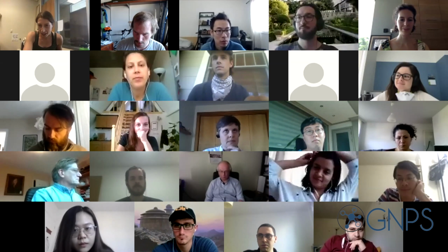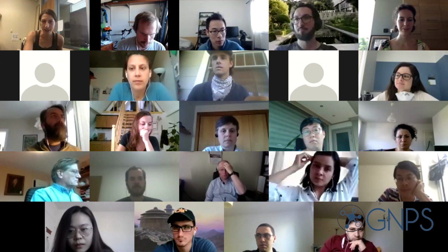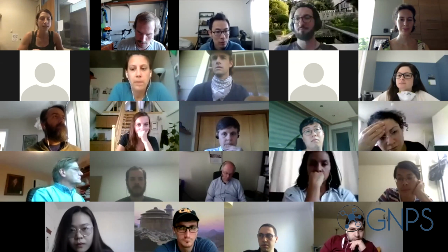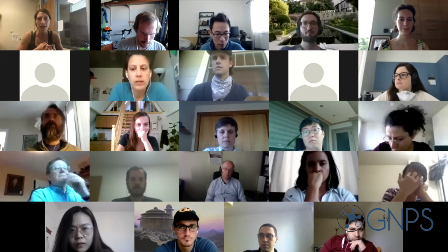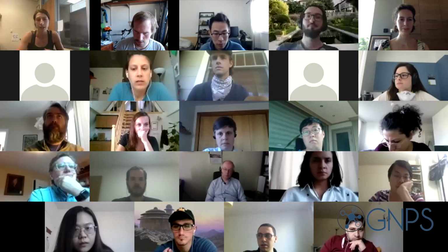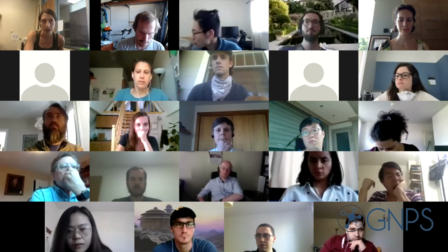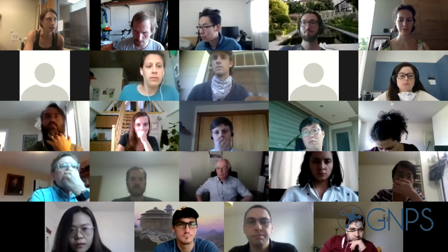So now I'm going to share my screen with you. As previously, going through Cytoscape is all detailed in the slides. So if you get lost, I would suggest going to the slides, but I'm just going to go through it on my screen. Hopefully that works for everyone. Let me pull this up.